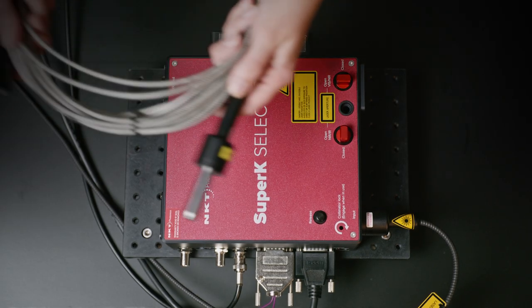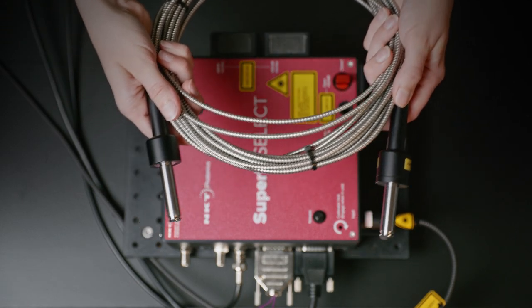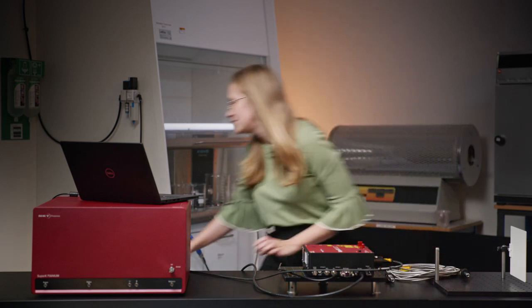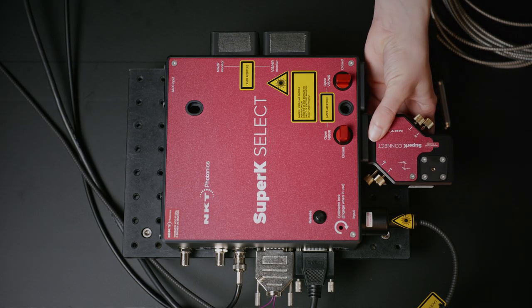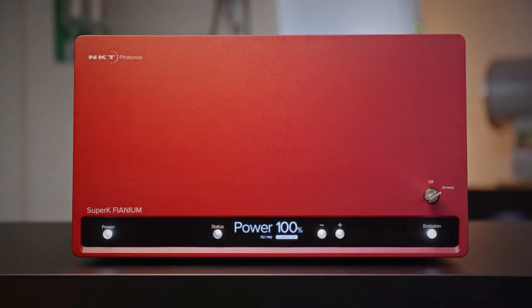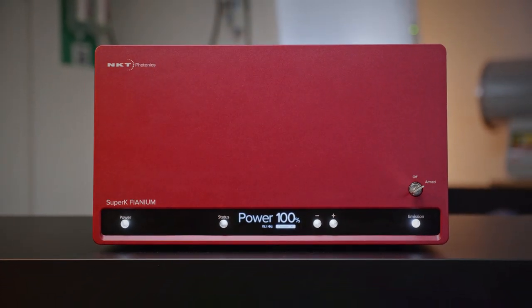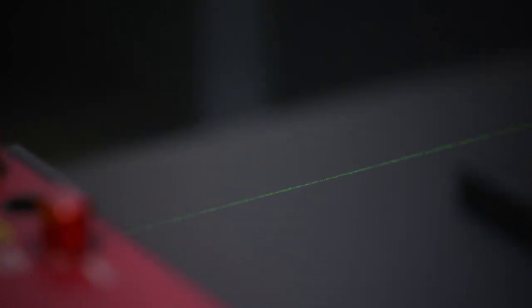And now you know how to set up the Super K-Extreme with different filters. If you need the light further away from the laser, we also have a fiber-based beam delivery cable. To use that, you add the Super K-Connect module and plug the fiber in. The Super K-Extreme is a good choice for microscopy, fluorescence, lifetime imaging, OCT, spectroscopy, hyperspectral imaging, and characterization of plasmonics and metamaterials.